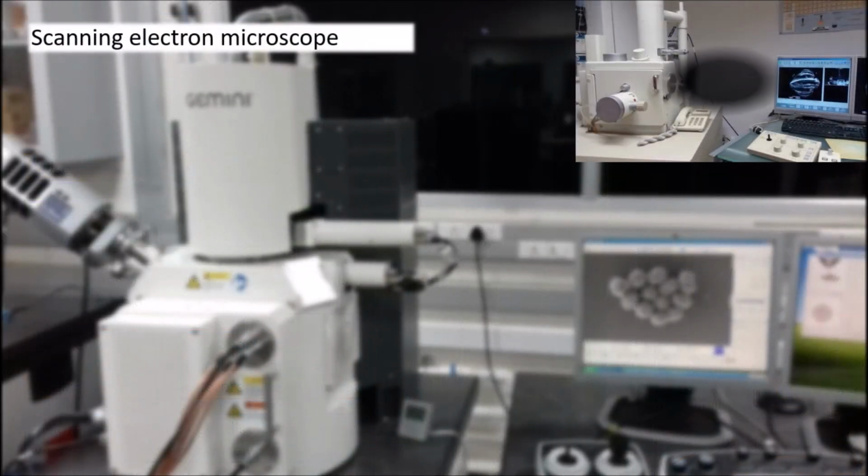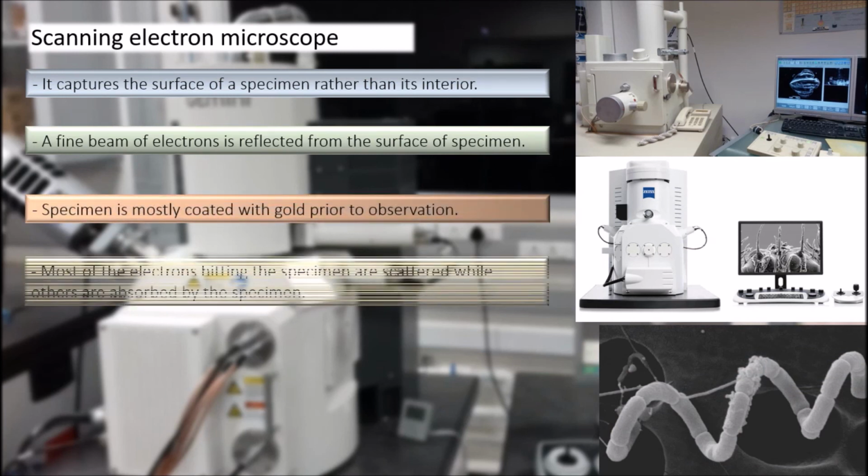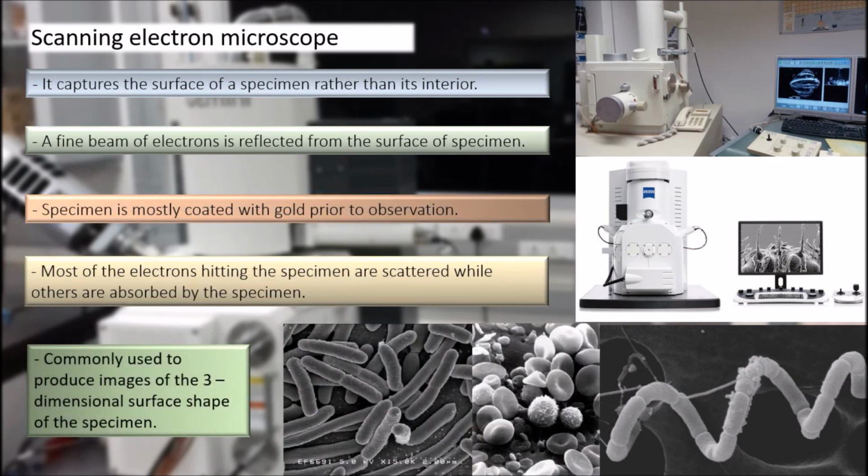Scanning electron microscope. A scanning electron microscope captures the surface of a sample rather than its interior. Here, a fine beam of electrons is reflected from the surface of the specimen. Extensively prepared specimens are not needed because electrons do not have to travel through the specimen. The specimen is mostly coated with gold prior to observation.